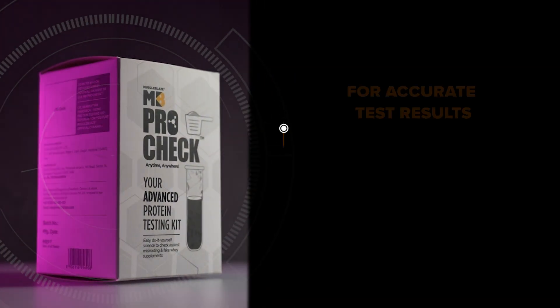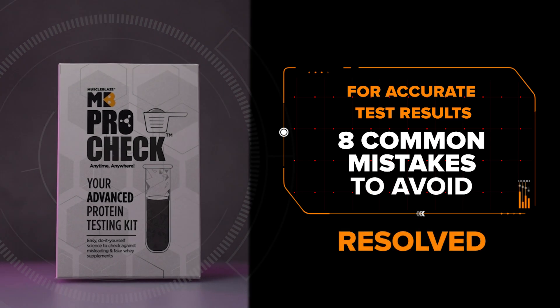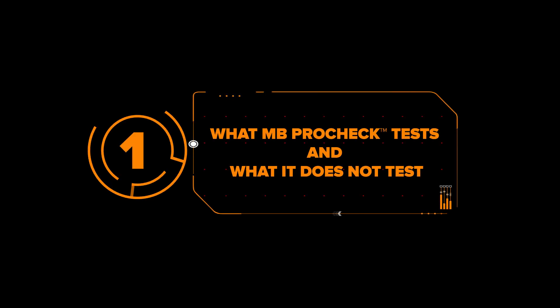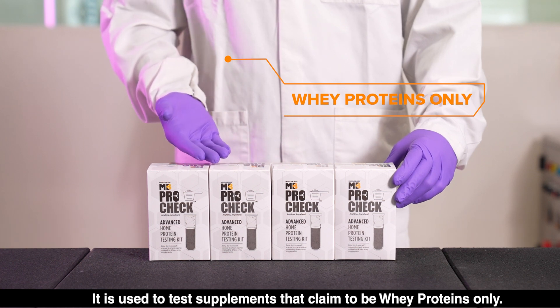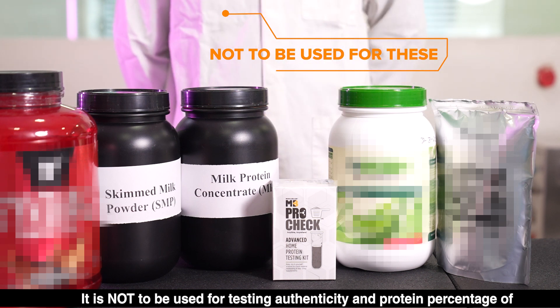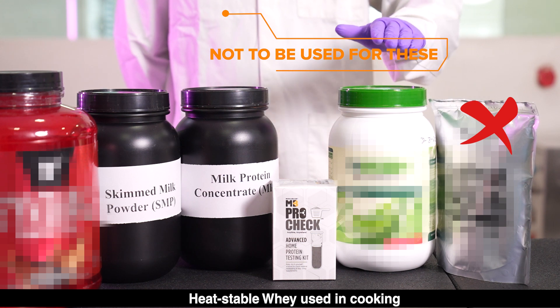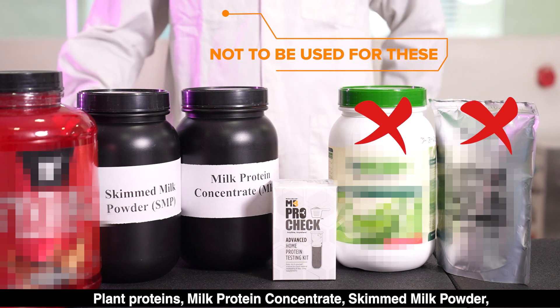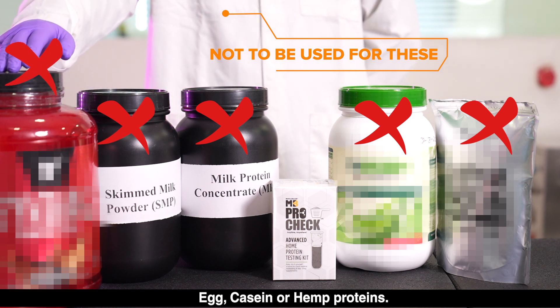MB ProCheck Kit for Accurate Test Results: 8 Common Mistakes to Avoid. Mistake 1: What MB ProCheck tests and what it does not test. It is used to test supplements that claim to be whey proteins only. It is not to be used for testing authenticity and protein percentage of heat-stable whey used in cooking, plant proteins, milk protein concentrate, skimmed milk powder, egg, casein, or hemp proteins.